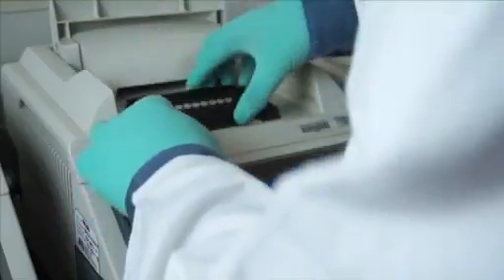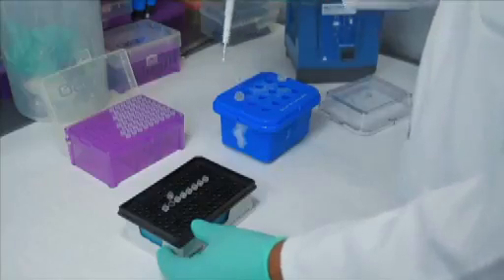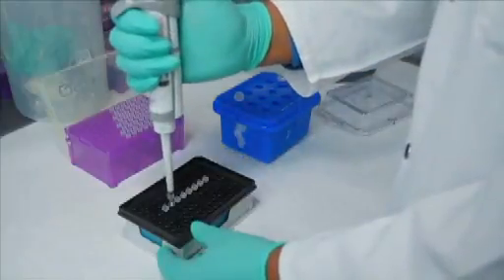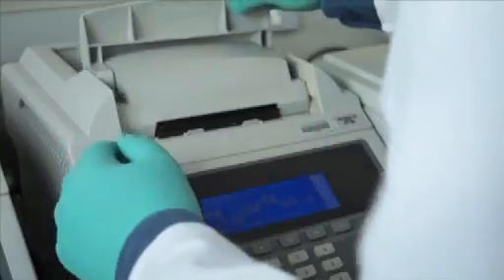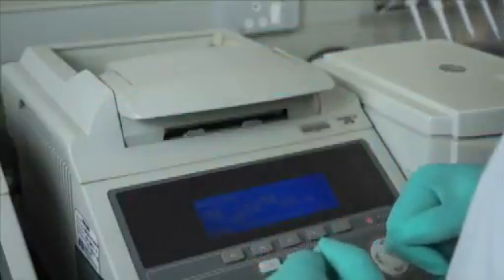Take the tubes out of the thermocycler. Quickly add 0.5 microliters of RNase H to the tubes and return to the thermocycler. Hold at 37 degrees Celsius for 20 minutes and then cool to 4 degrees Celsius.